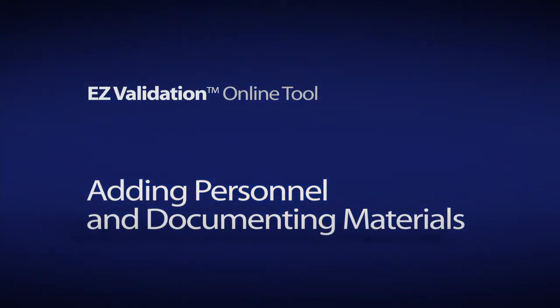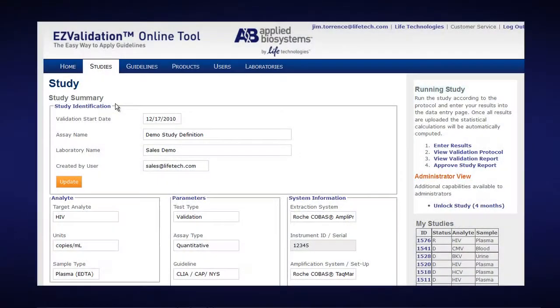Adding personnel and documenting materials. As you're defining your study in the EZValidation Online Tool, you'll also want to add personnel and document materials used.